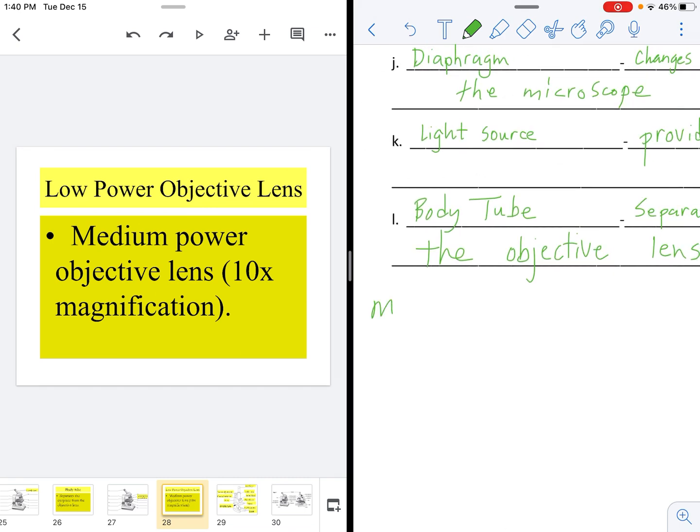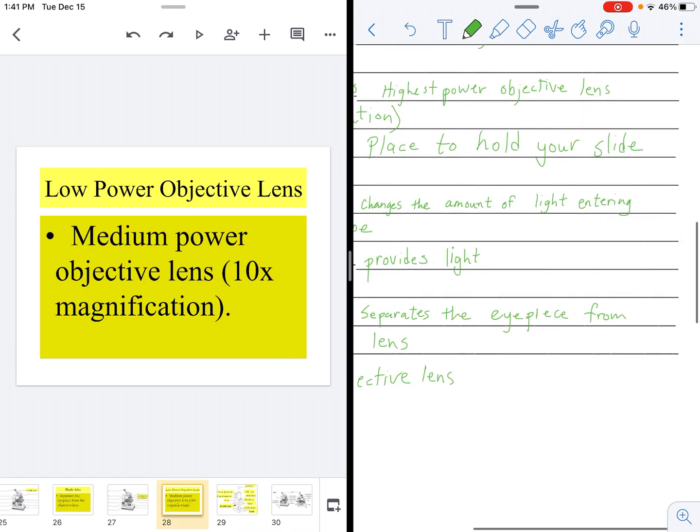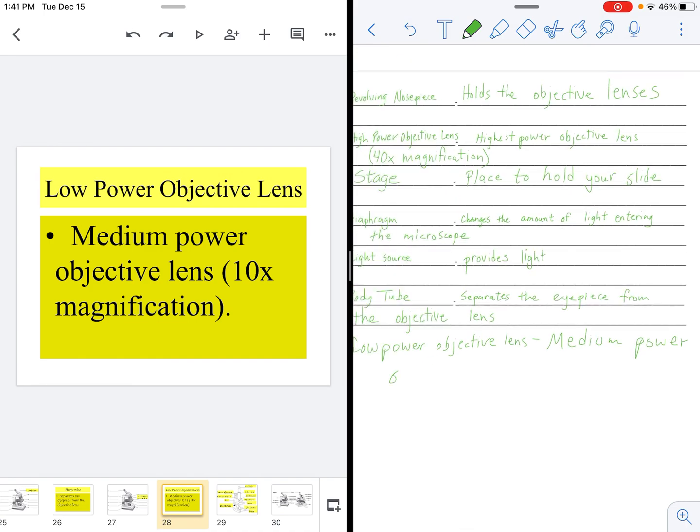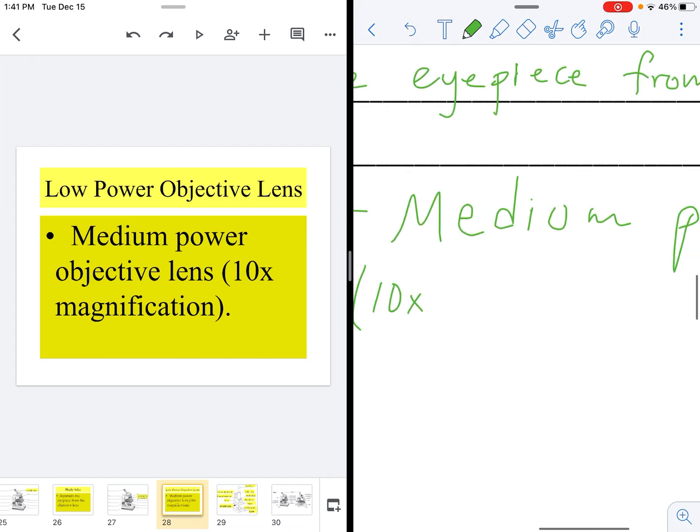I forgot to add it to the document, so I apologize for that. And that magnifies things 10 times.